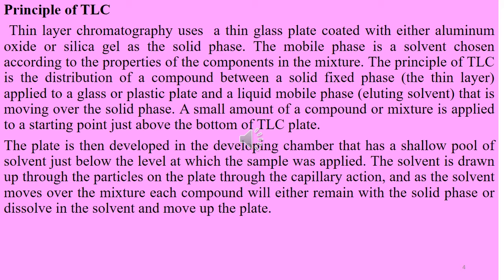Adsorption chromatography involves the analytical separation of a chemical mixture which is based on the interaction of the adsorbate with the adsorbent. The mixture of a gas or liquid gets separated when it passes over the adsorbent bed that adsorbs different compounds at different rates.